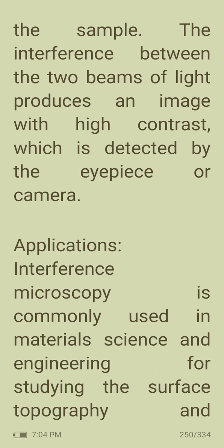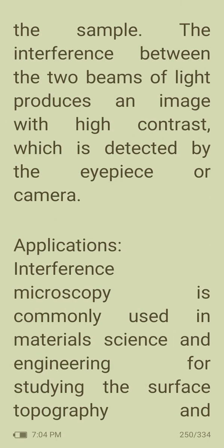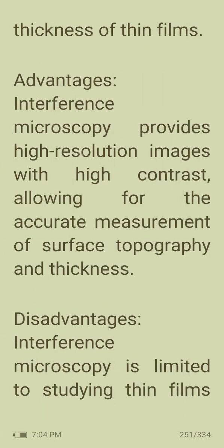Interference microscopy is commonly used in material science and engineering for studying the surface topography and thickness of thin films. Interference microscopy provides high resolution images with high contrast, allowing for the accurate measurement of surface topography and thickness.